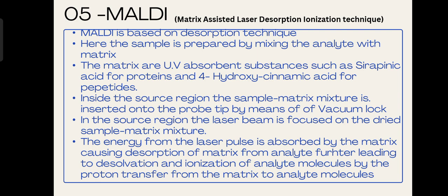In one of the ionization techniques, we have used the matrix before, that is in the case of fast atom bombardment. Do watch my previous video. In MALDI also we are using the matrix, but here the matrix used is a UV absorbent substance such as sinapinic acid for proteins and 4-hydroxycinnamic acid if the analyte is peptides.